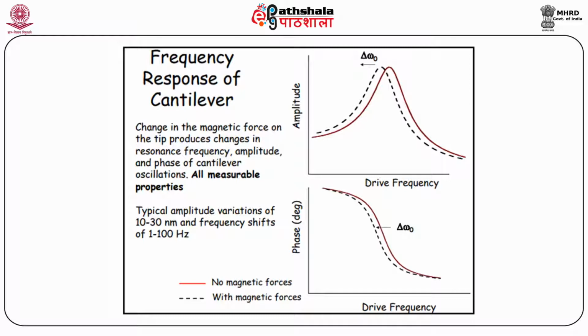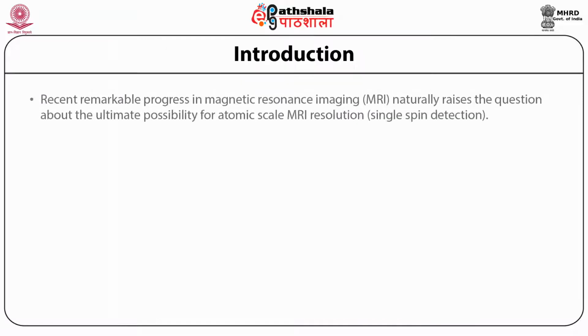measurements with magnetic force. Recent remarkable progress in magnetic resonance imaging (MRI) naturally raises the question about the ultimate possibility for atomic scale MRI resolution, single spin detection.